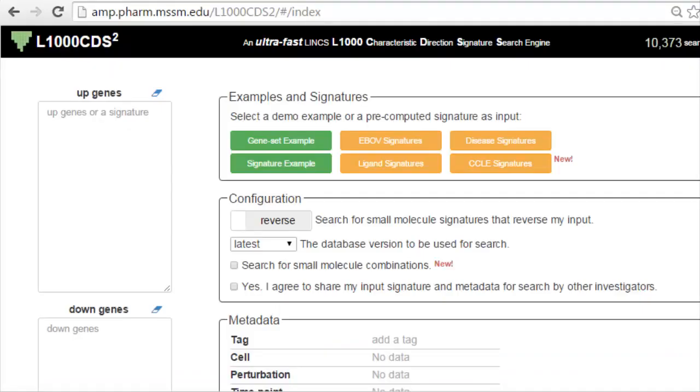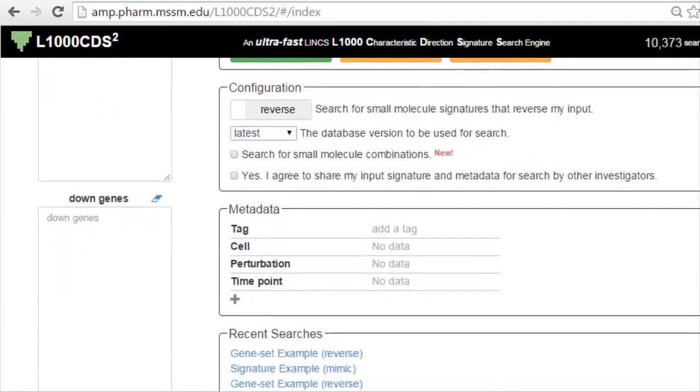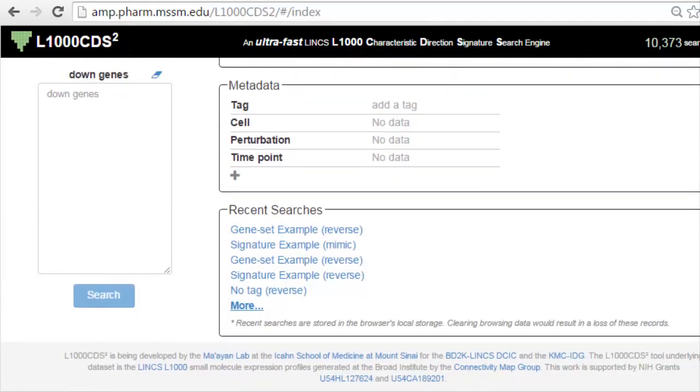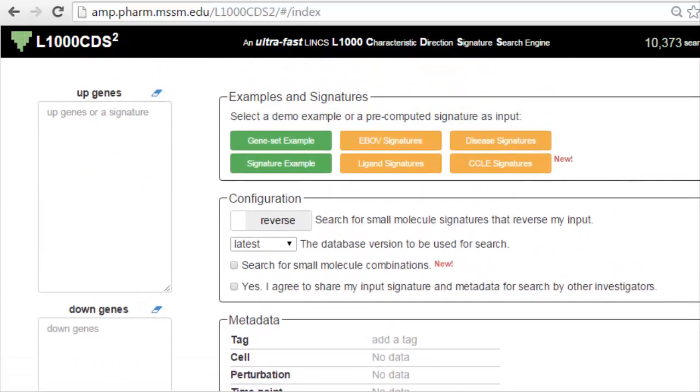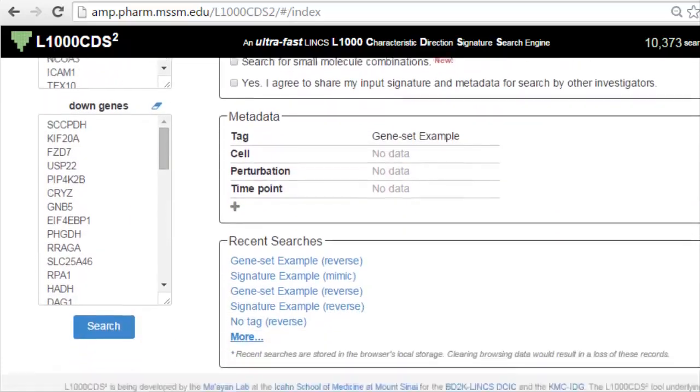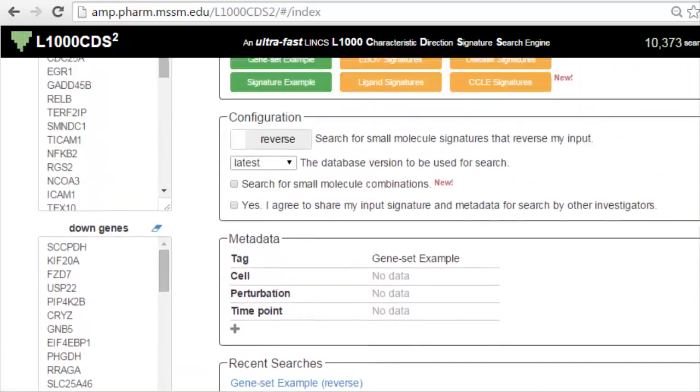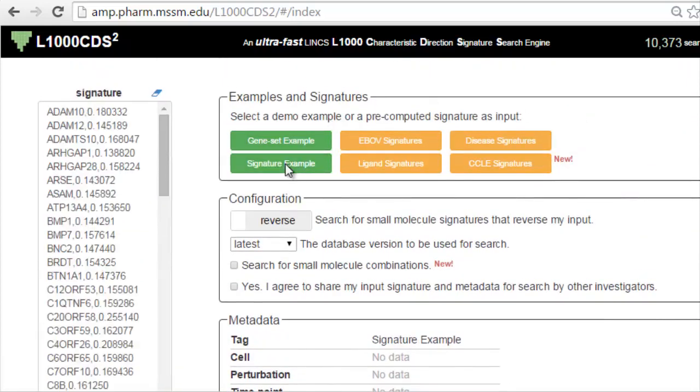The app gene text box will automatically detect if the input is a gene list or a signature. The search button will only become enabled when both up and down gene text boxes are filled with gene lists or when the app gene text box is filled with a signature. Clicking the search button displays the information for the top 50 signatures that match the input list in a table on a new page.